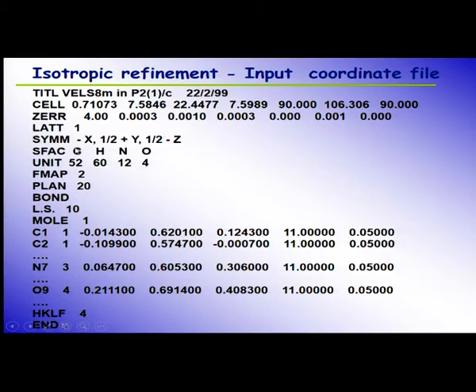This is known as isotropic. Iso means same. Now, I am going to run a program called SHELXL. Here I want to do the least square refinement. How many cycles? 10 cycles. Okay. Do you want to find any extra peaks? Yes, if they are there.